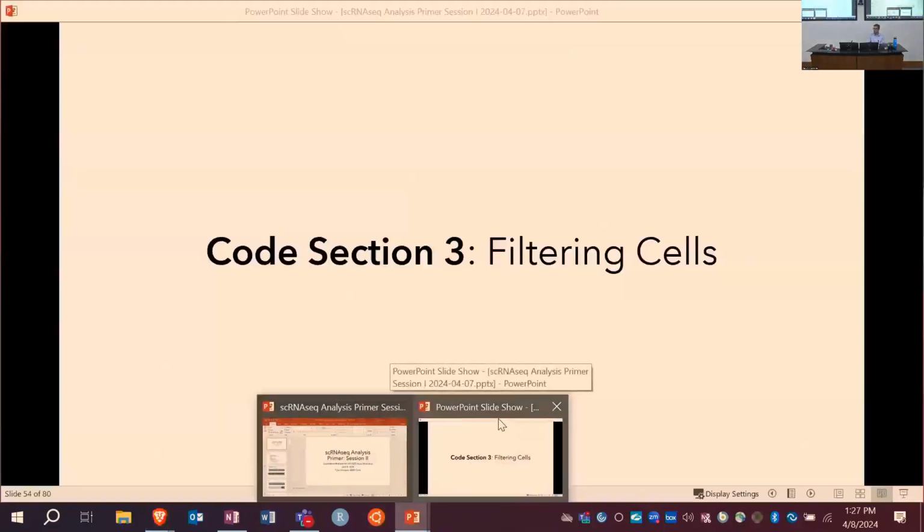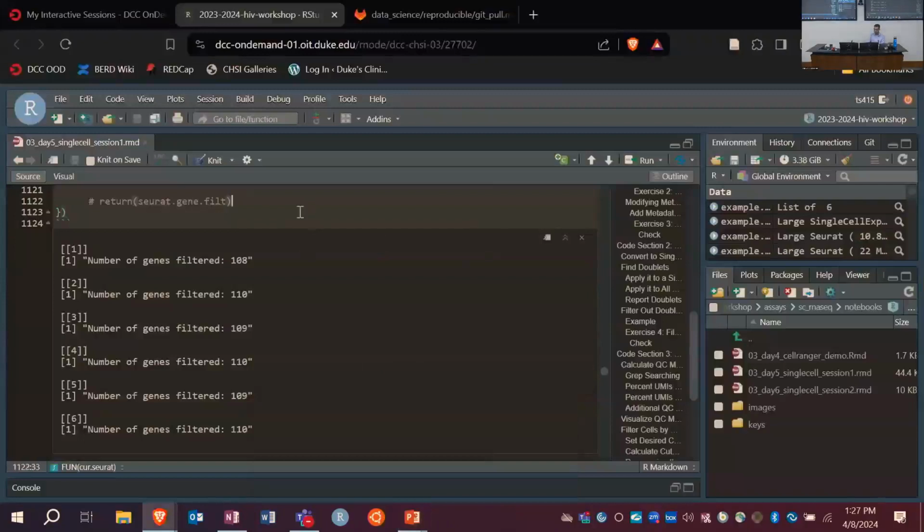So I've been doing something similar. I think I set a hard cutoff of like 15% mitochondrial genes, because I guess that's commonly done. Yeah, I guess the rationale here is that even if one cell is high for one of these QC metrics, if everything else is normal, it's probably not a weird cell.